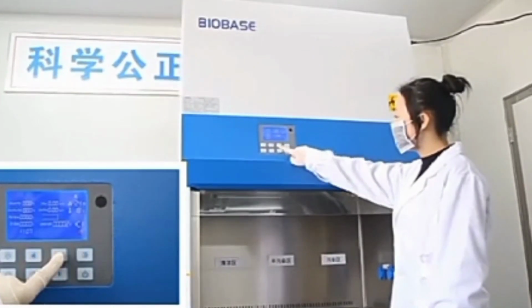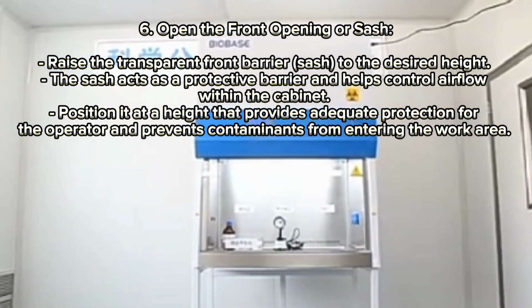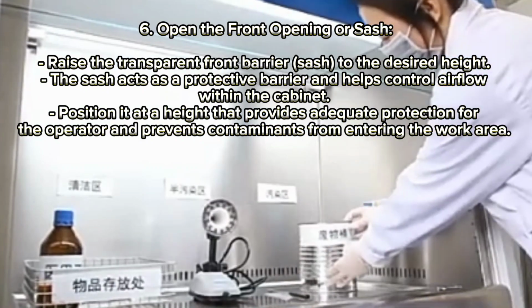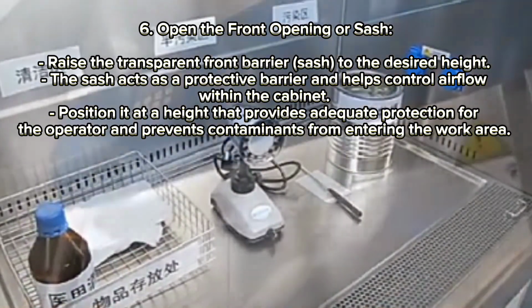Next is open the front opening or sash. Raise the transparent front barrier, or sash, to the desired height. The sash acts as a protective barrier and helps control airflow within the cabinet. Position it at the height that provides adequate protection for the operator and prevents contamination from entering the work area.